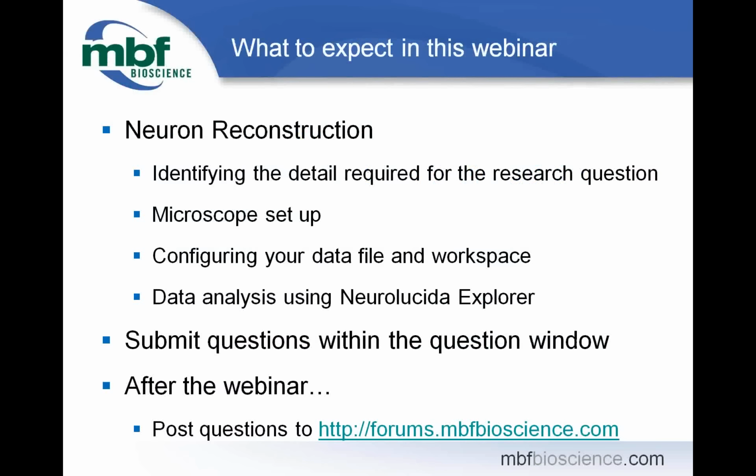The webinar will last 60 minutes and is divided into 4 topics. The goal for today's webinar is to provide a practical demonstration using Neurolucida for neuron reconstruction. The data you require to test your hypothesis will ultimately drive how you use Neurolucida for cellular reconstruction.